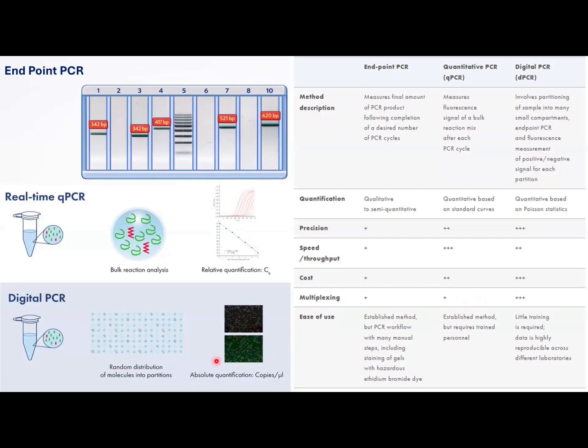Coming on to digital PCR. Digital PCR is a recent technique which helps in rare event detection. It is based on Poisson statistics, where it identifies the presence of a positive droplet among, say, 10,000 or a lakh of negative droplets. That is how it depends on the fragmentation of the reaction volume. It is very precise. The advantage of digital PCR is that it does not require a standard, whereas real-time PCR requires a standard. But the drawback is it has a high cost, right? Single sample of digital PCR you can process.